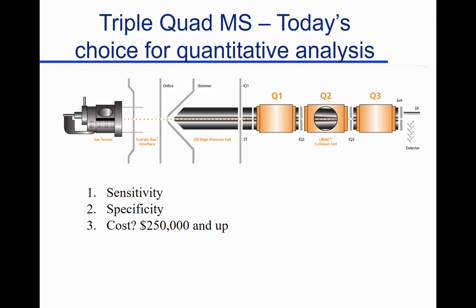And so this permits you to look at every fragment and see that those fragments are the same throughout the system. If that doesn't make sense, I probably won't put more effort into it, but it's absolutely a great way to, again, make sure the compounds are the same, or if they're not the same, that you can actually separate them. So you may have the same fragments, but you look at the fragments of the fragments. Okay, we'll let it go at that.